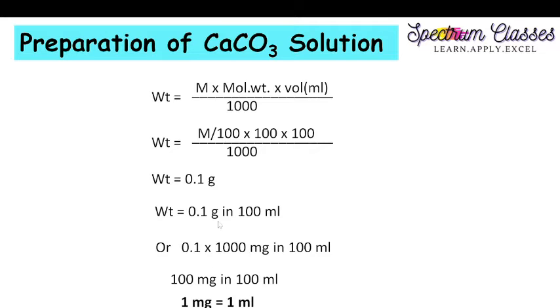I simply do the calculation using the formula. So 0.1 gram needs to be dissolved in 100 mL. Now I am going to show you the lab activity related to the preparation of this M/100 calcium carbonate solution.